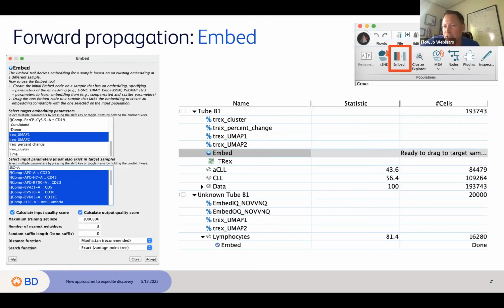You can imagine a cell whose nearest neighbors come from cluster 1, cluster 1, cluster 1, cluster 1, cluster 1, cluster 1, and cluster 2. We don't want the output to be 1.1. We'd like it to say, yeah, it's cluster 1. It's 9 out of 10 neighbors ended up in cluster 1. It must be a cluster 1.